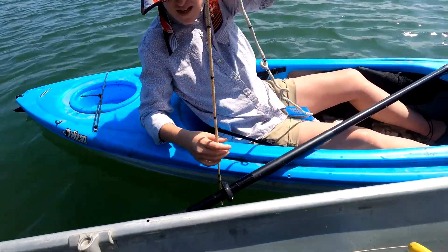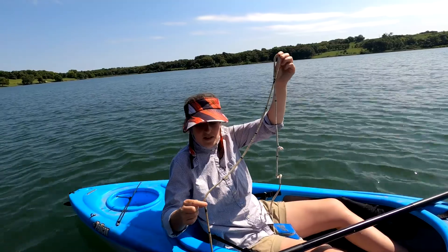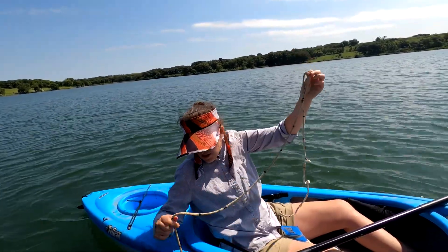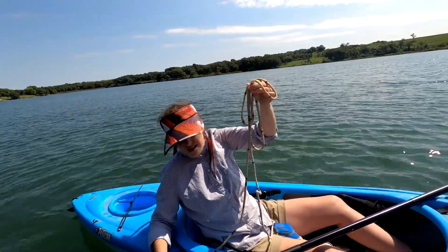So the triple line represents a meter, the double line represents 50 centimeters, and each of these individual lines represents 10 centimeters. So we got at least one meter and 10 — two meters and 10. That's pretty good.